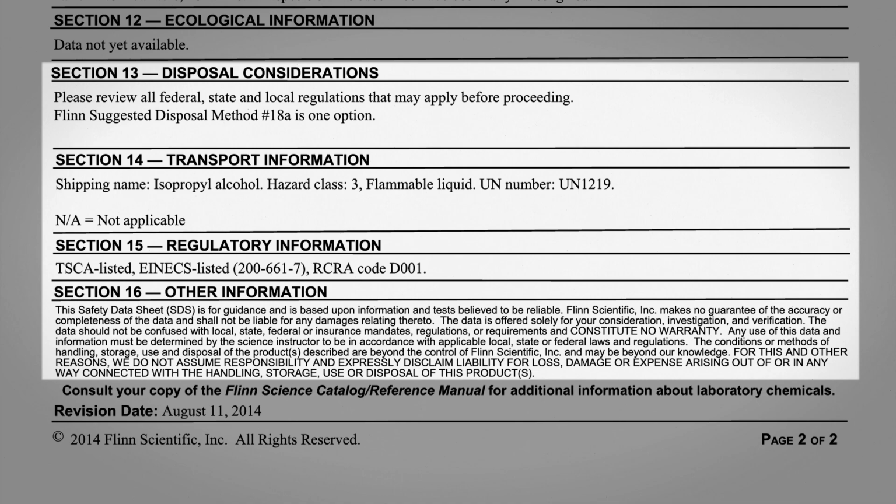of this video. Remember, working safely with chemicals requires that you recognize their hazards, understand risks, minimize those risks, and prepare for emergencies. All of this information can be found in the SDS, which is why it's such an important document and crucial for your safety in the lab.